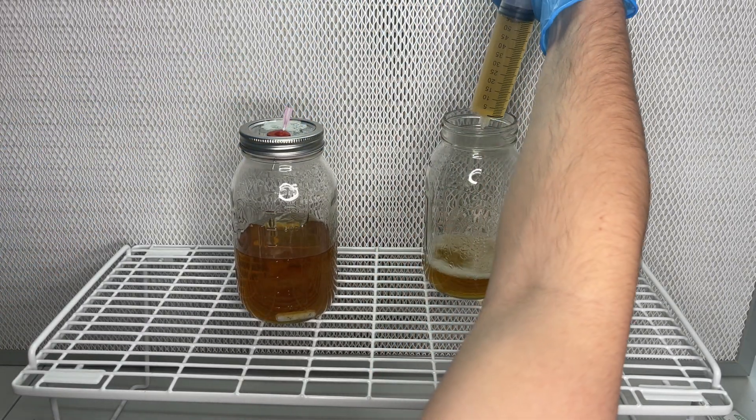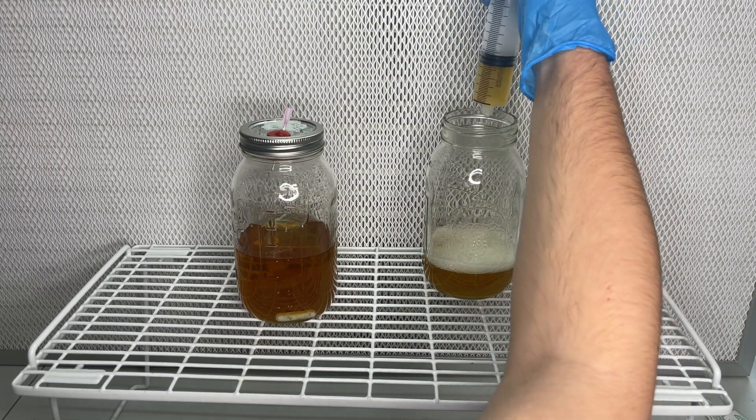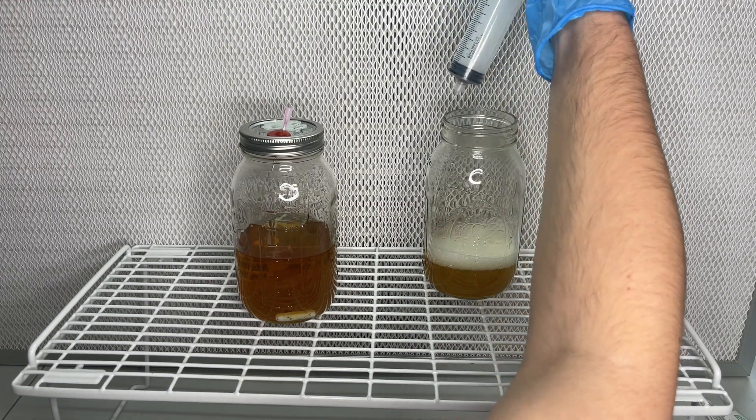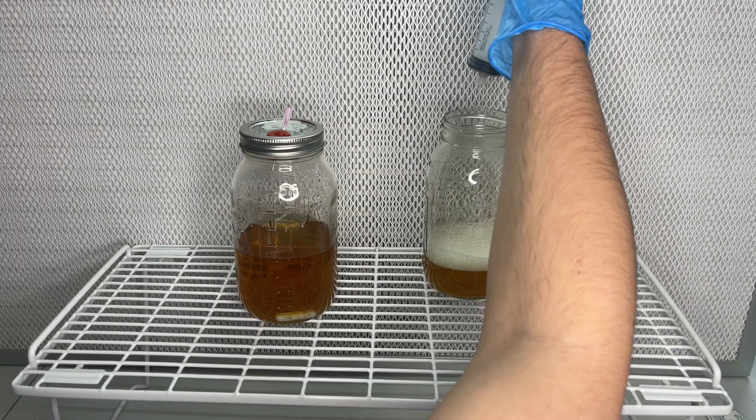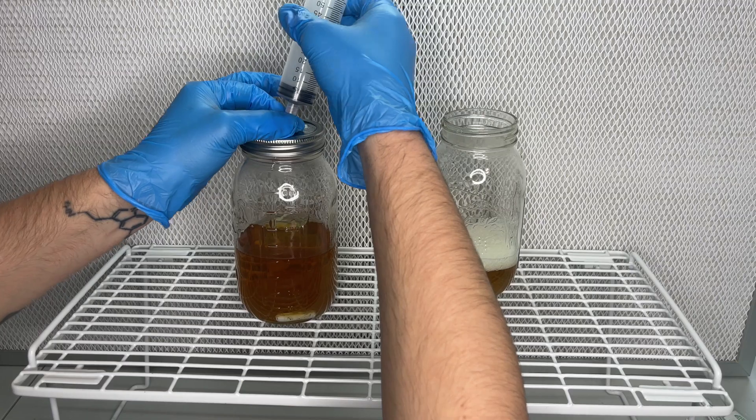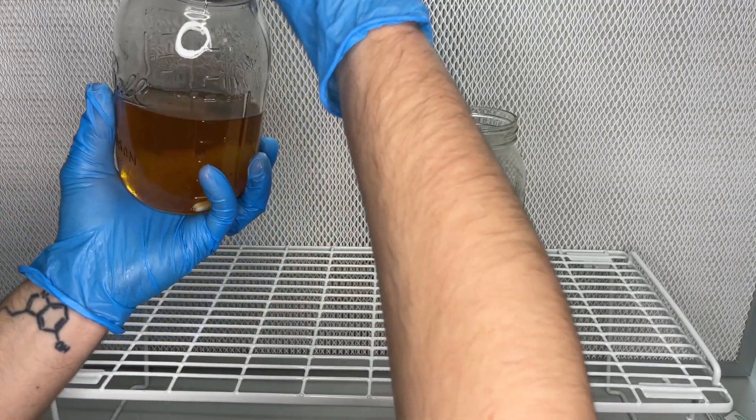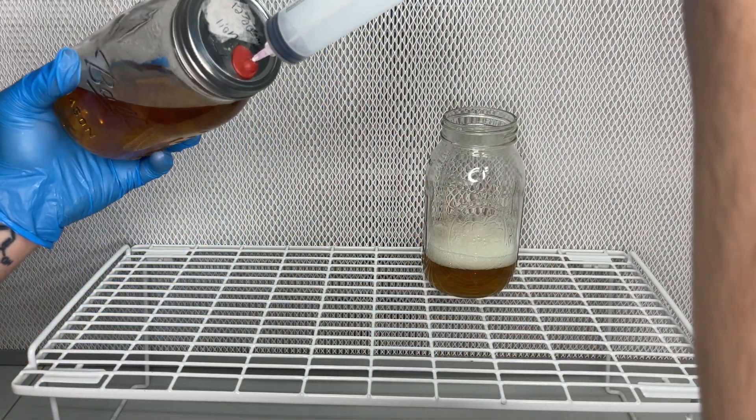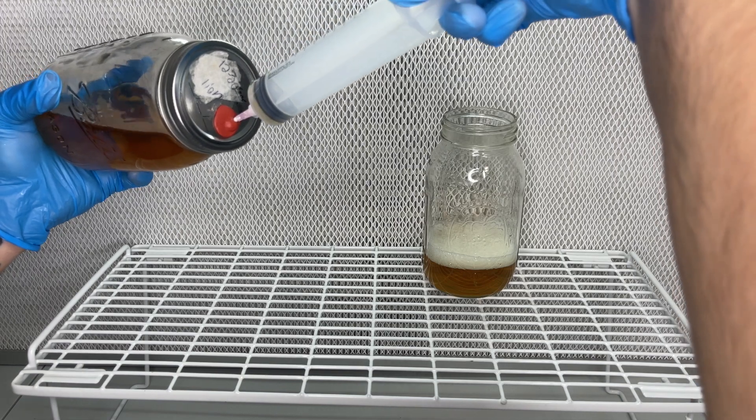Because once you start twirling the jar, the mycelium strands break apart from each other, and then you're just collecting little strands with a lot of liquid. So you'd have to wait for the mycelium to settle to the bottom, and then slightly twirl it and wait for that cloud or clump of mycelium to pass by the needle.